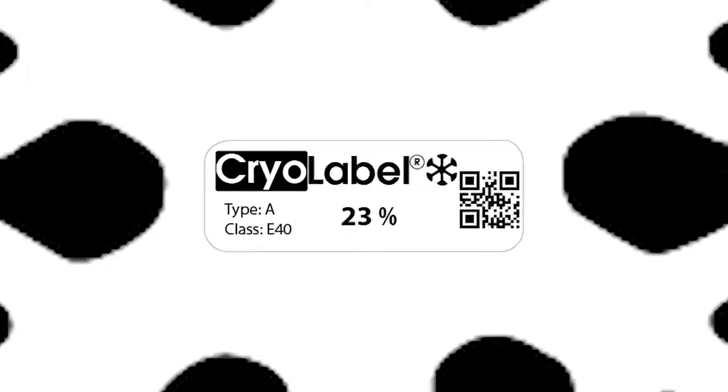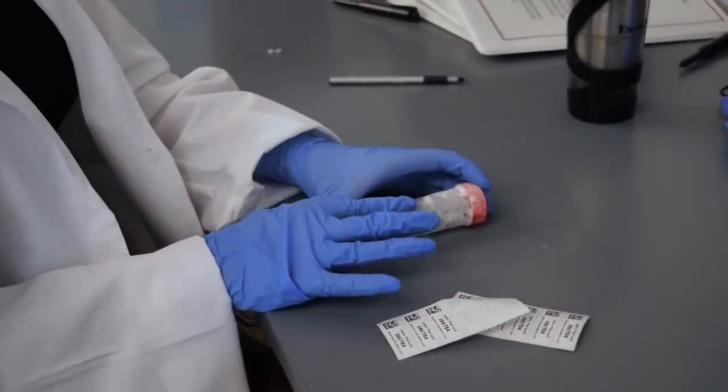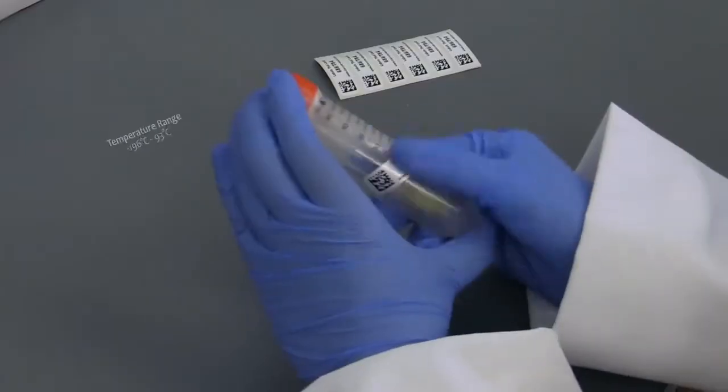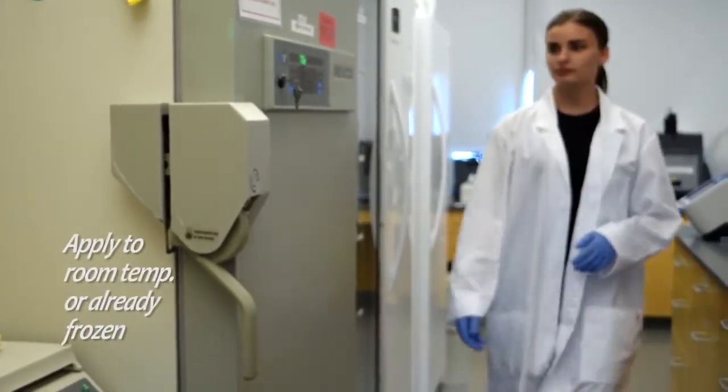It might be time for your lab to upgrade to cryolabels, the original pressure sensitive label for marking cryogenic storage. Cryolabels can be used on containers that are stored as low as negative 196 Celsius. They can be applied to regular or already frozen containers.